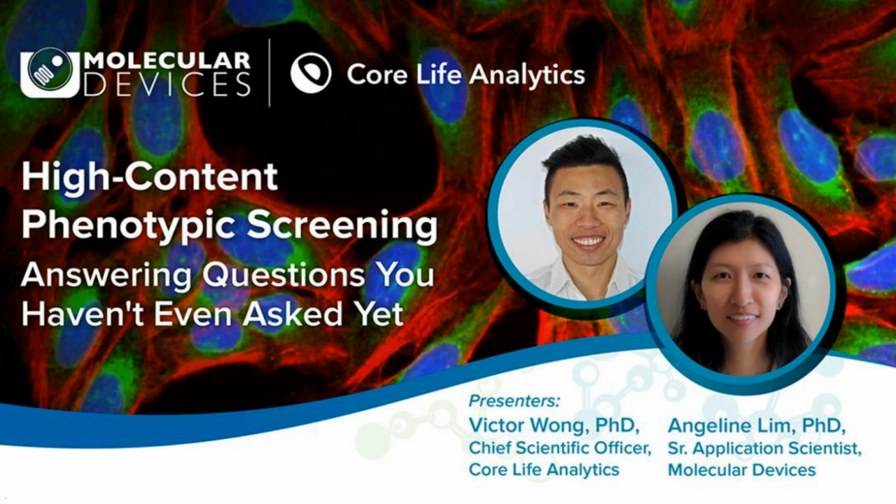And regarding the StratoMineR software, that also depends on the granularity of the data. So if it's captured at the object level, single cell level, field level, or well resolution, usually within an hour, you can analyze hundreds of plates at the well level and at field level, and usually at single cell level, depending on how large the data is. So number of plates and number of features and number of cells per well. It can take up to a few hours if you get into, let's say, tens or hundreds of plates.